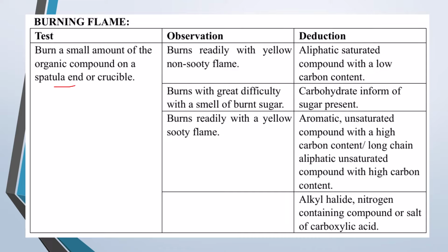Now a spatula end, some of you improperly misunderstood this. For a spatula end, your spatula must not be full of the substance. It simply means the level at which your spatula stops. So that's where your substance must be filled at.